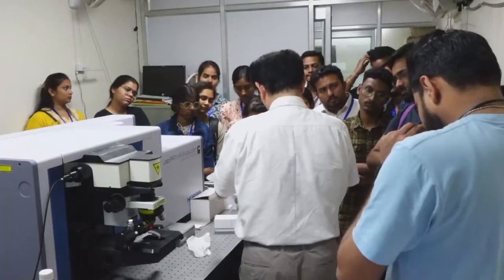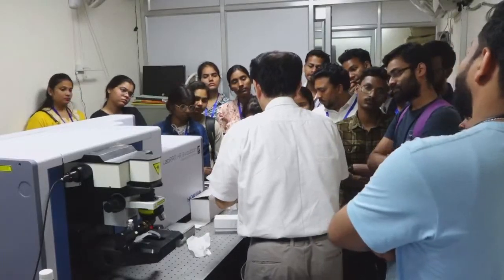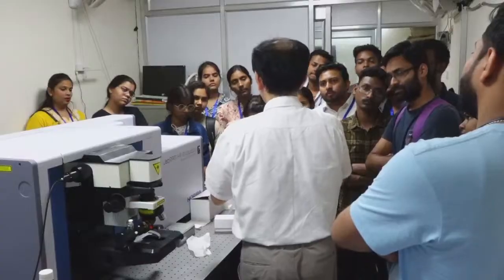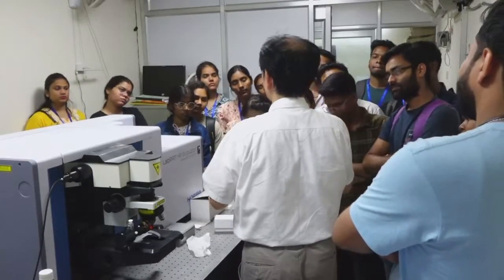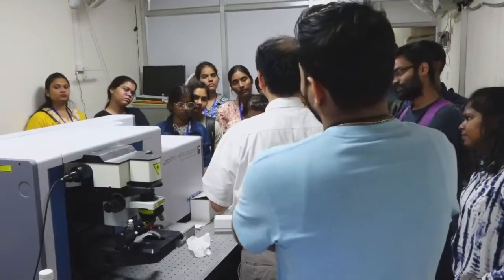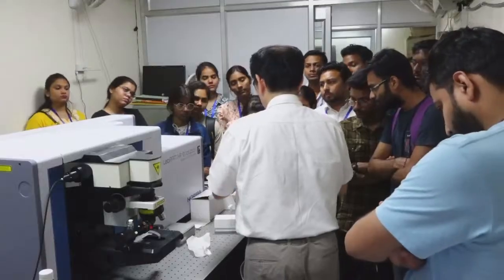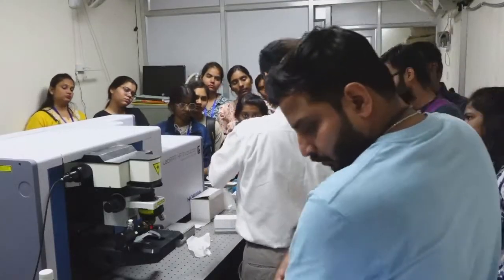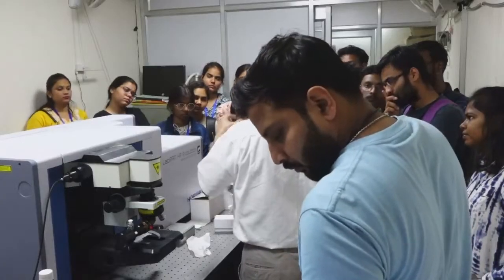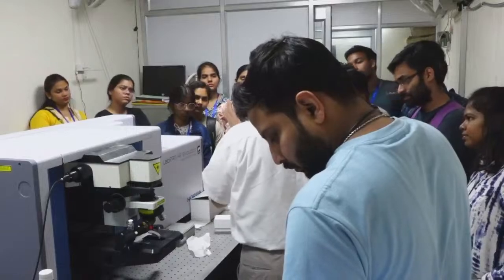But we must know a strong laser beam can damage the sample. If the sample is a solid material, such as a semiconductor, it would be okay. But if we want to study the status of skin or living cells, a strong laser makes it carbon burn.